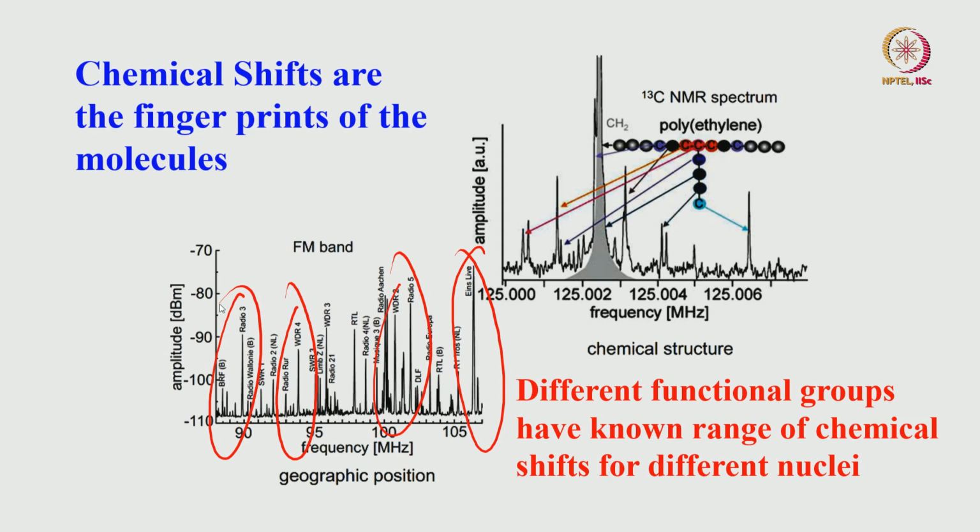It is like different radio stations having different frequencies. For example, there is a frequency which comes at Mysore, one which comes at Dharwad, one at Bangalore, different radio frequencies, but each frequency is constant. Similarly, the ranges of frequencies for functional groups are constant, but it is not a dogma, it can vary. By and large it is only a guideline for you to start the analysis. Ranges are known more or less.